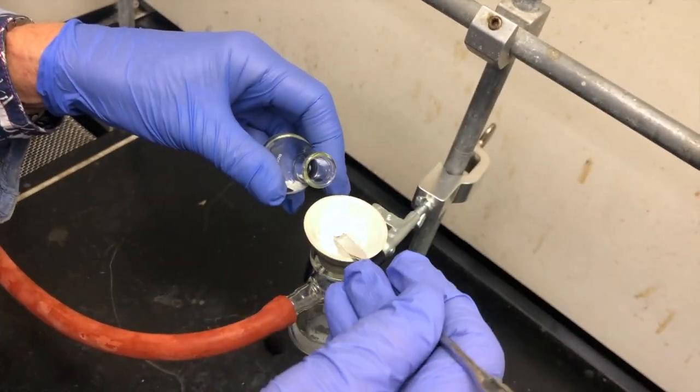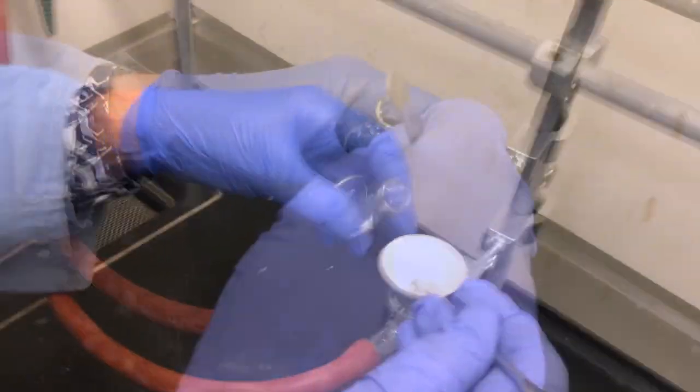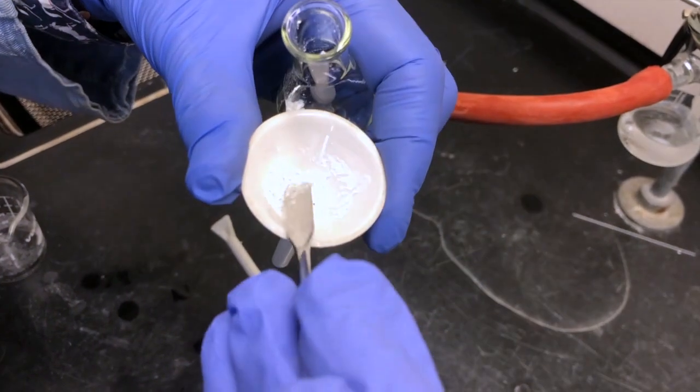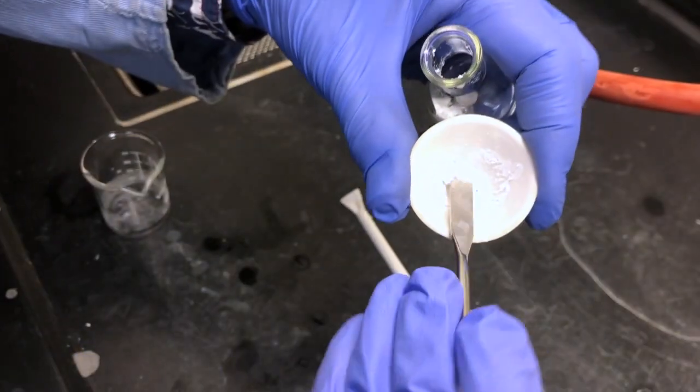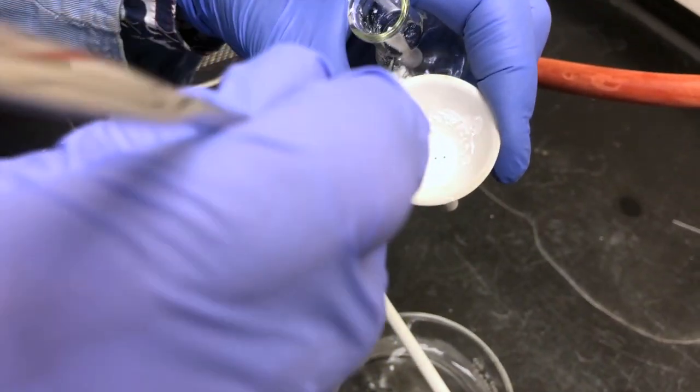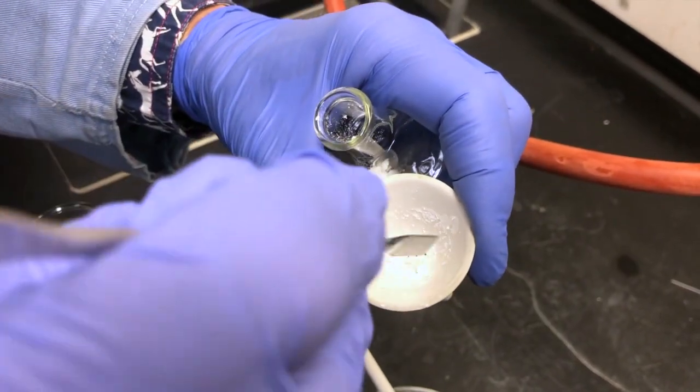It's a tedious process to get all the crystals out and you also have to be careful not to shred your filter paper in the process. You don't want to put any filter paper in with the product because it'll mess up the recrystallization. So remove that filter paper, scrape as much off as you can, get as much out, and transfer it all into that Erlenmeyer flask.